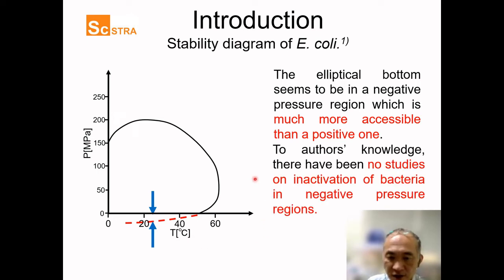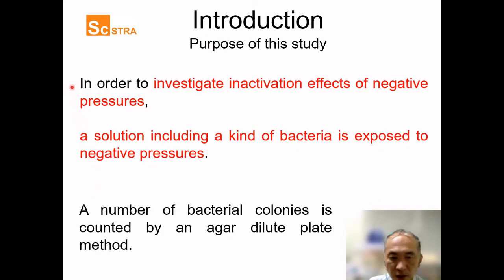To the author's knowledge, there have been no studies on inactivation of bacteria in negative pressure regions. Thus, the purpose of this study is as follows. In order to investigate inactivation effects of negative pressures, a solution including a kind of bacteria is exposed to negative pressures. A number of bacterial colonies is counted by an agar dilute plate method.